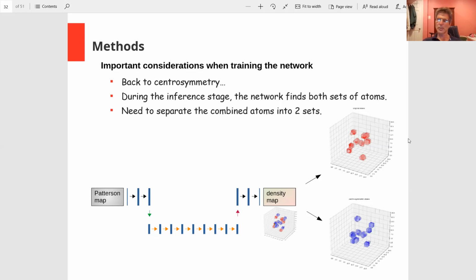But if you're solving for proteins at atomic resolution, say, then you should be able to figure out which is the correct model because of the chirality of the residues in the protein. And so the user can figure out which of these two will be correct. Okay, so how to do that?